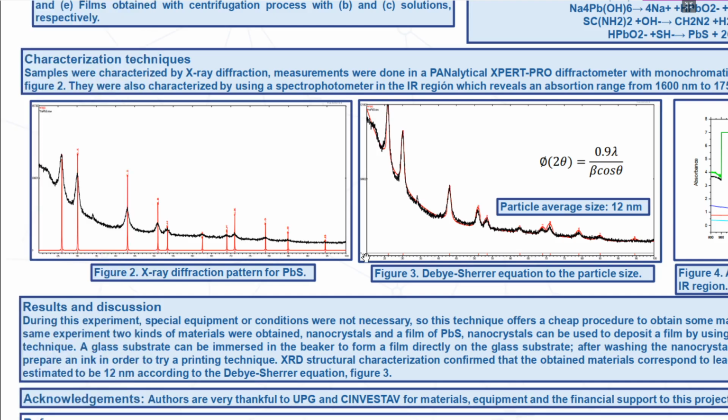The X-ray diffraction pattern also reveals that the formation of this compound corresponds to PbS.